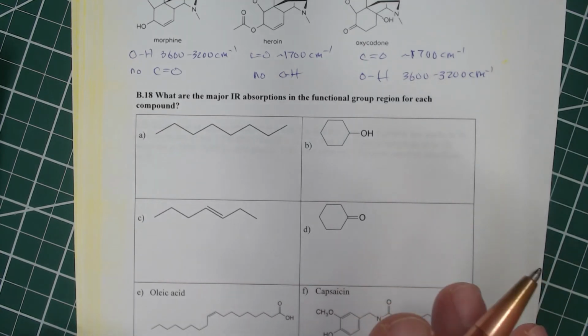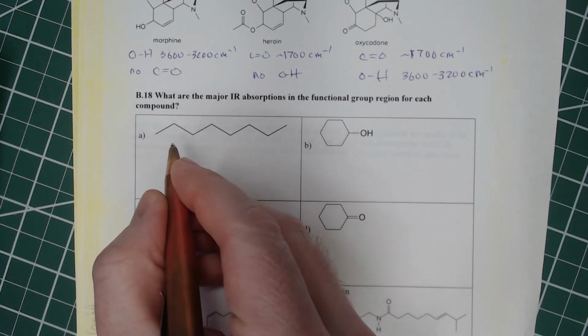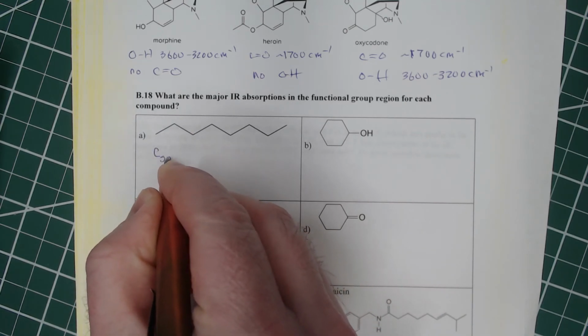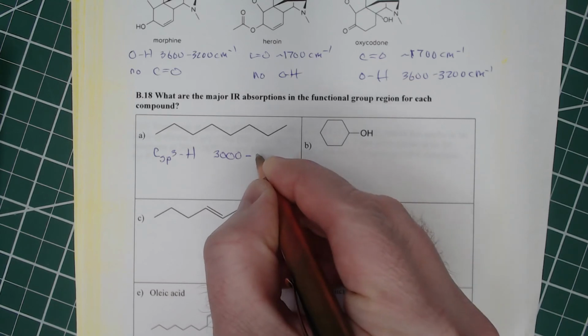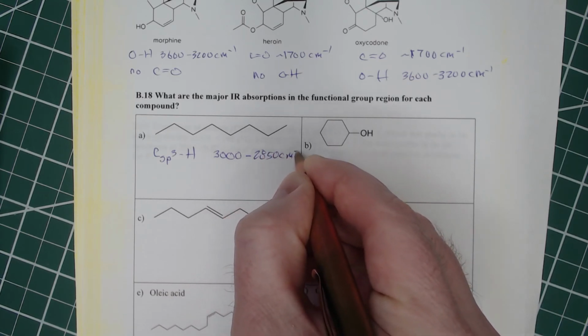We don't want to worry about fingerprint. This one, there's only one that we're really interested in, and that's carbon sp3 hydrogen. And at this point, you probably have memorized this from 3,000 to 2,850 reciprocal centimeters.